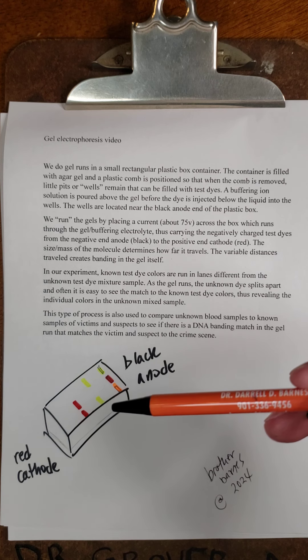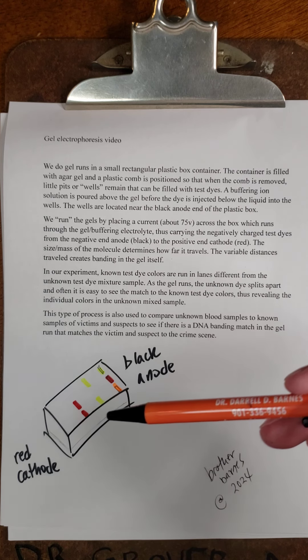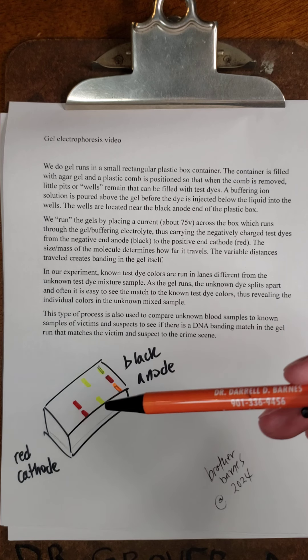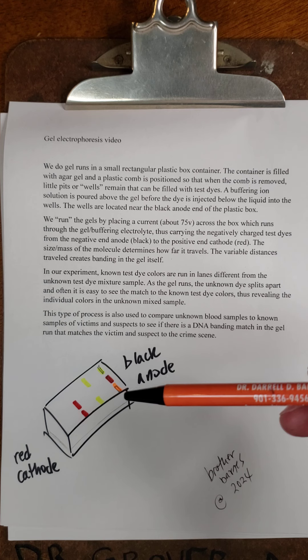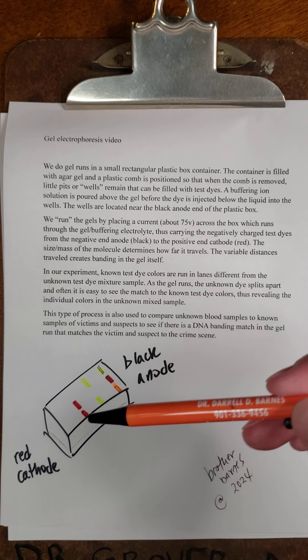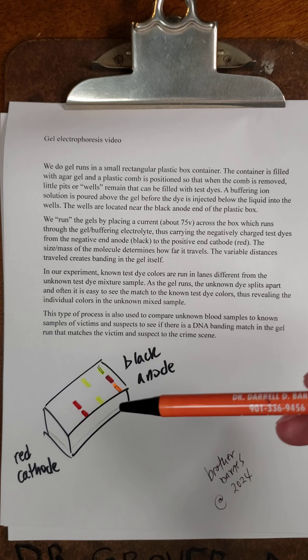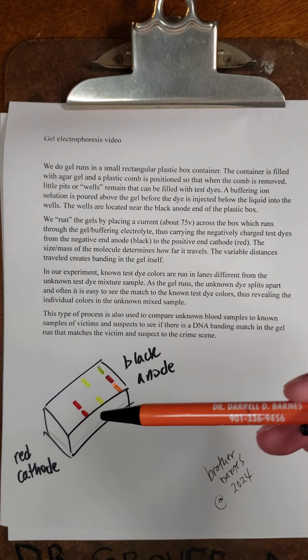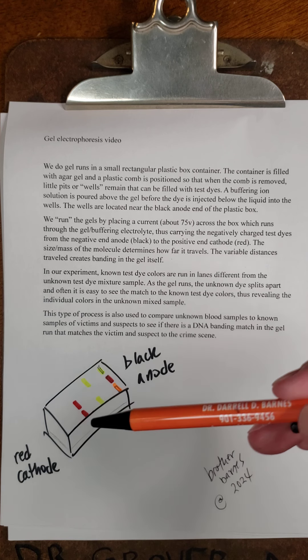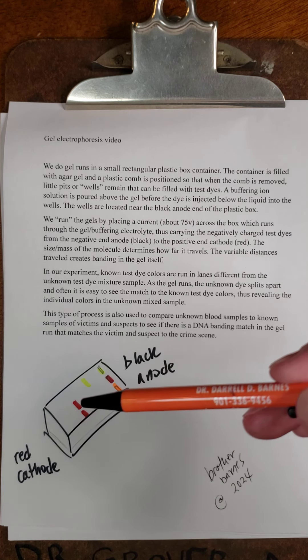The variable distances traveled creates banding in the gel itself. In our experiment, known test dye colors, in this case yellow and red, are run in lanes different from the unknown test dye mixture sample. As the gel runs, the unknown dye splits apart. Here you can see a yellow band and a red band, and often it is easy to see the match to the known test dye colors.